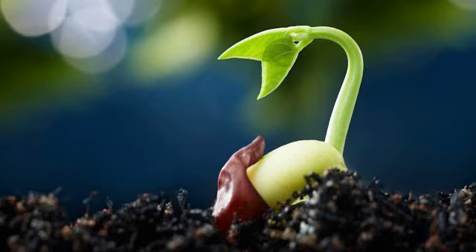Hard seed: seeds which do not absorb moisture till the end of the test period and remain hard, as in Leguminosae and Malvaceae families. Fresh ungerminated seed: seeds which are neither hard nor have germinated but remain firm and apparently viable at the end of the test period.